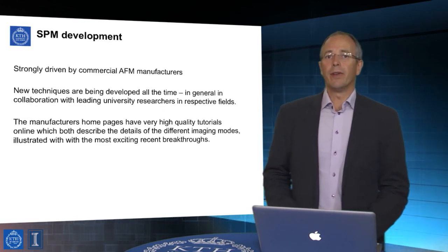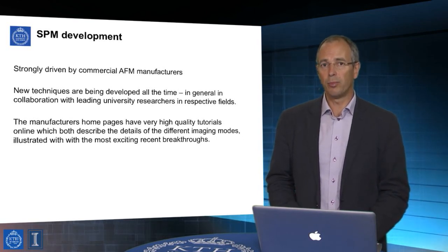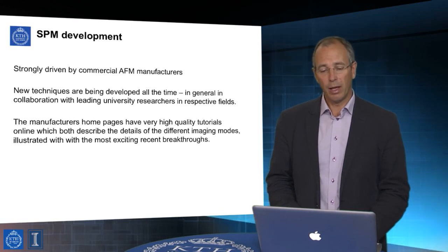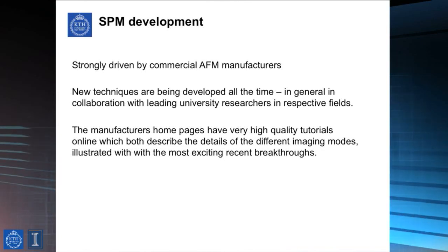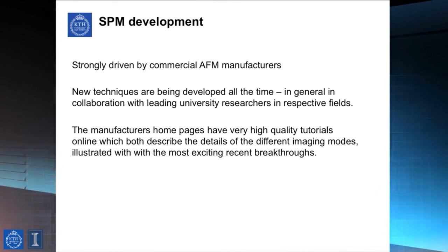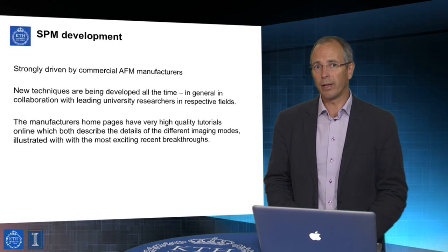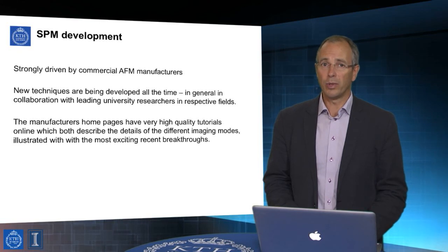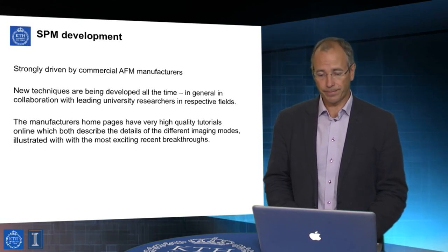One of the things that characterizes development of SPM is that it's largely driven by commercial players. So there's a few big commercial AFM developers out there. A lot of the novel techniques and pushing the envelope of the technology are being done by them in collaboration often with leading universities. And if you're interested in particular imaging techniques or particular materials and how to use AFM with them, what you'll find is that the manufacturers have very professional homepages which give you instructions how to treat and study the material that you're interested in.